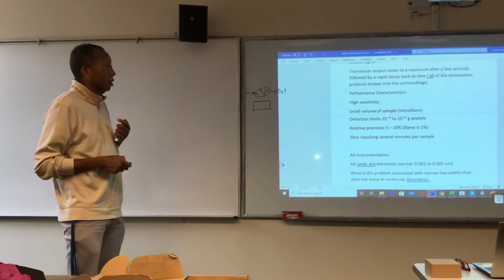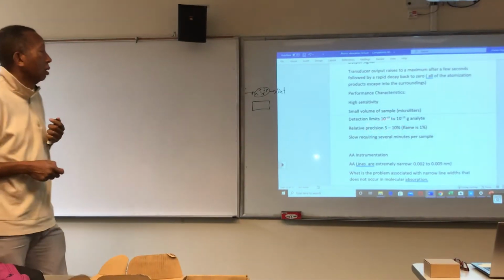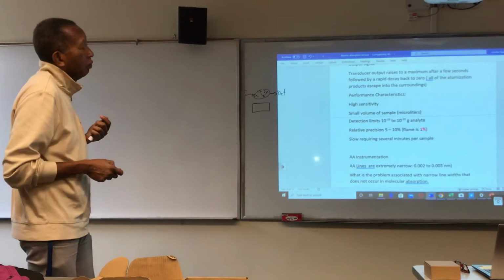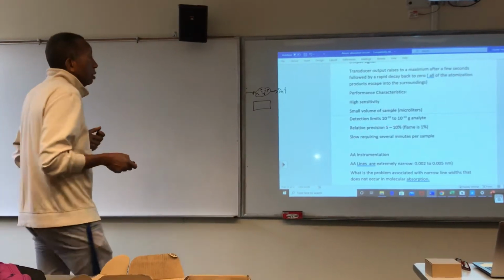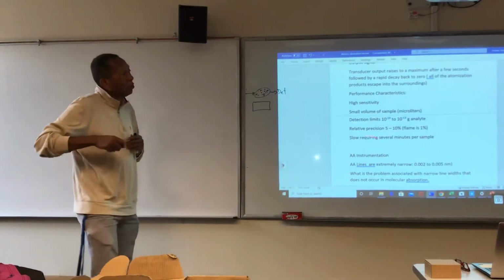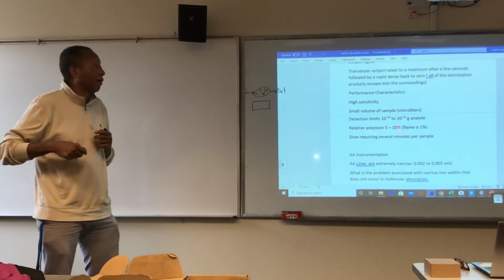10 to the minus 13, or 10 to the minus 10. That's really great. Precision is not as good as the flame. The flame is 1%, and this is 5 to 10%. Remember where this comes from, when you're talking about precision.